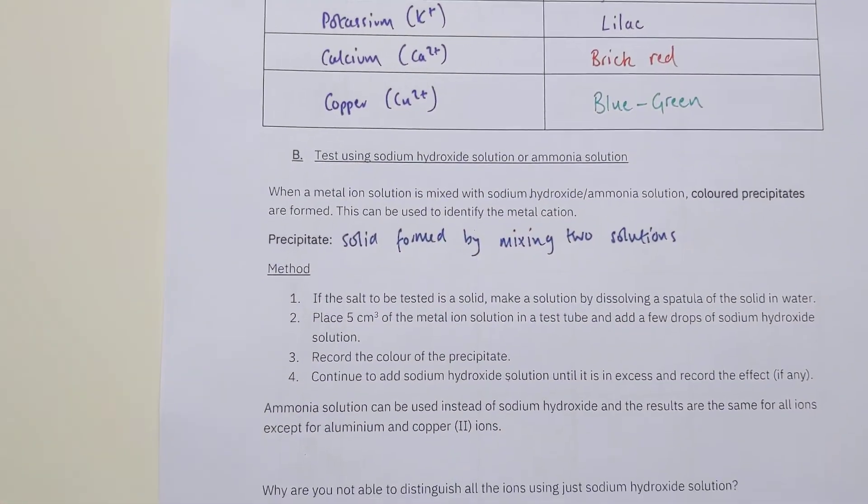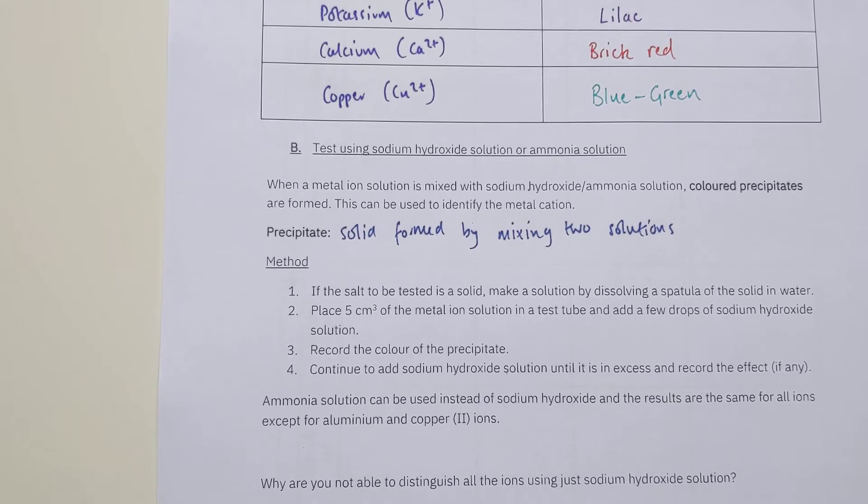Here's the method you use. If the salt to be tested is a solid, make it into a solution first by putting it in water. Five centimeters cubed of that solution in the test tube, add a few drops of sodium hydroxide solution or ammonia solution. Record the color of precipitate. In some cases you might want to see what happens if you keep adding sodium hydroxide or ammonia. You might see the precipitate dissolving again, which can be useful to tell apart some similar looking precipitates.